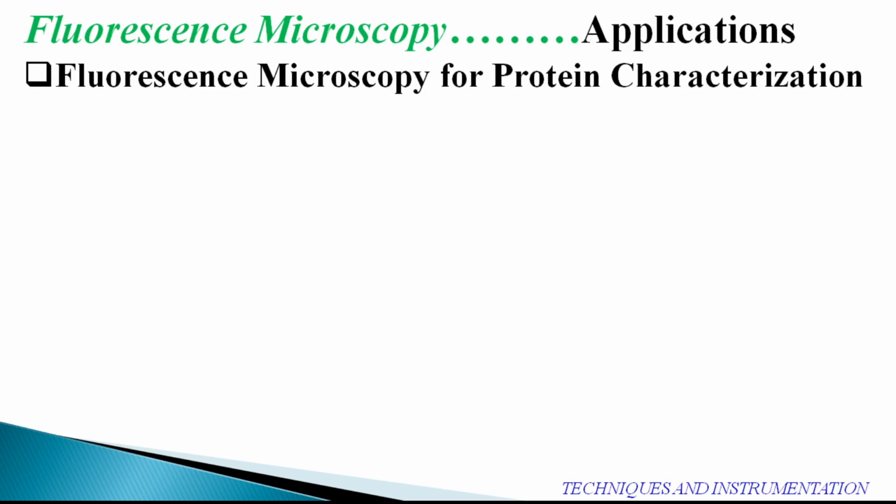So the implementations of this fluorescent protein biosensors is nowadays considered a novel approach, because these fluorescent protein biosensors are used to observe such types of weaker protein interactions, which are more often found at a broader application level in various fields of research.